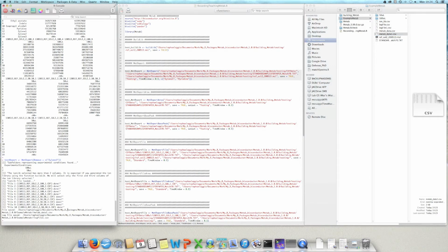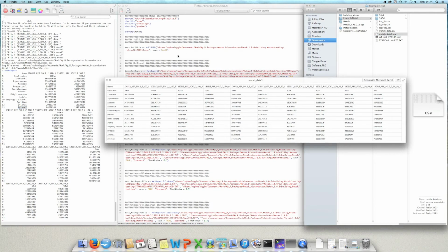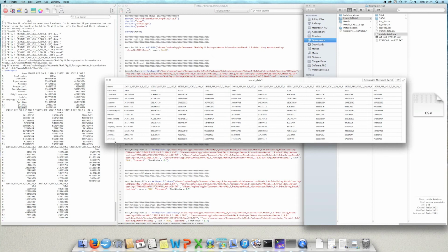So if I look for the results, test report, which is the variable that we use here to save the results. So now xylene 3 is not in the results. So it's out. If you see here the difference in the file as well. So xylene 2 and the first file xylene 3. So it's not there anymore.